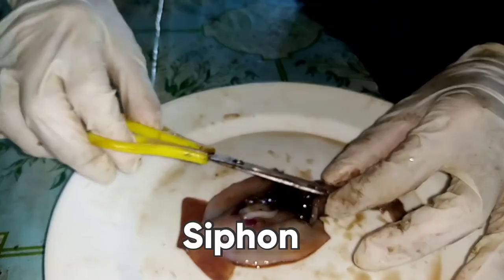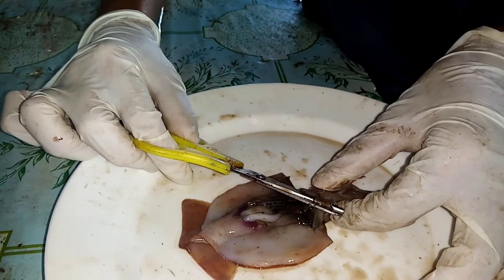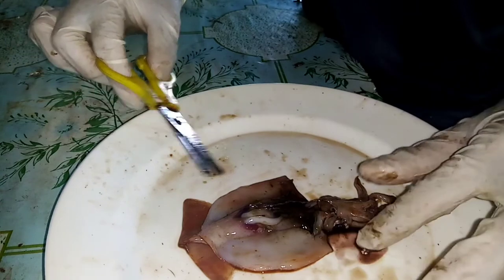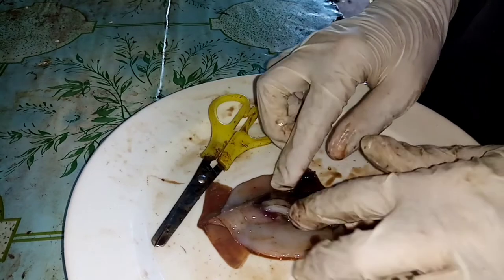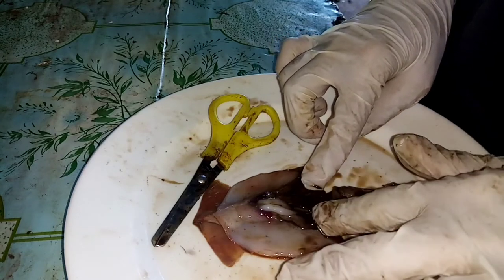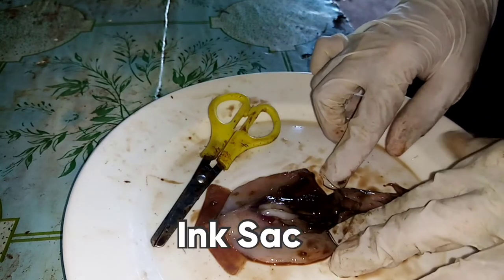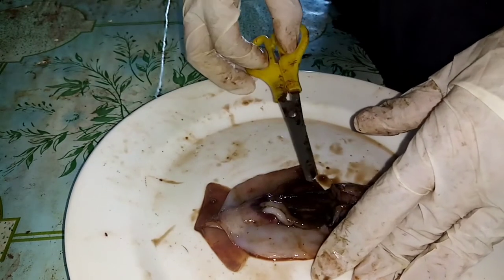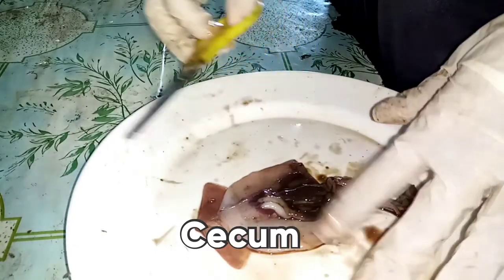As you can see, this part has a black outline and it has silver loops. So it is considered as the ink sac of the squid. And next to the ink sac, there is a digestive system and it is the cecum.